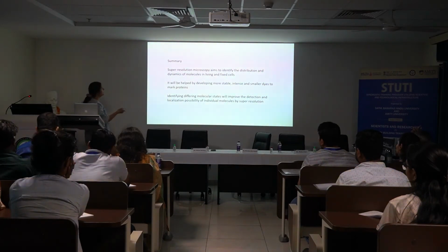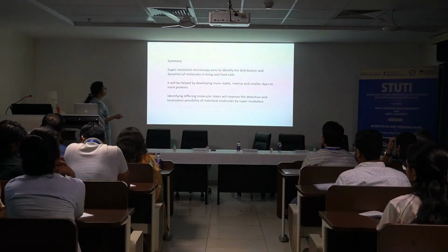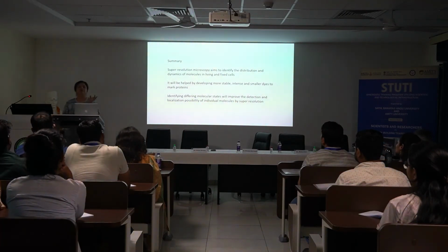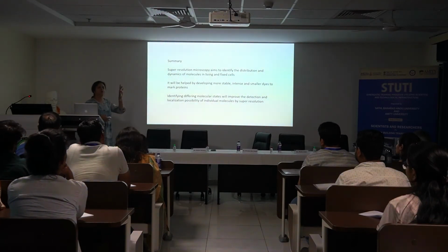So in that way, super resolution microscopy has achieved a lot of success. When you think about this, it's a physics problem, and it is trying to solve the interests of biologists. But finally, the concept of localization has already come about, all right?